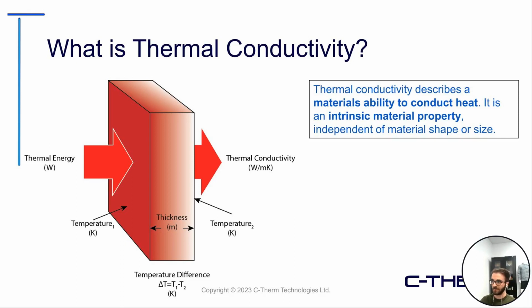So the thermal conductivity, if it's a new topic for you, if you're unfamiliar, this really describes a material's ability to conduct heat. It's an intrinsic material property, and what that means is irrespective of the size or the shape of the sample, it is something that will be true to that material in and of itself. For us here today, focusing on thermal conductivity in standard SI units, all data will be presented in terms of watts per meter Kelvin.